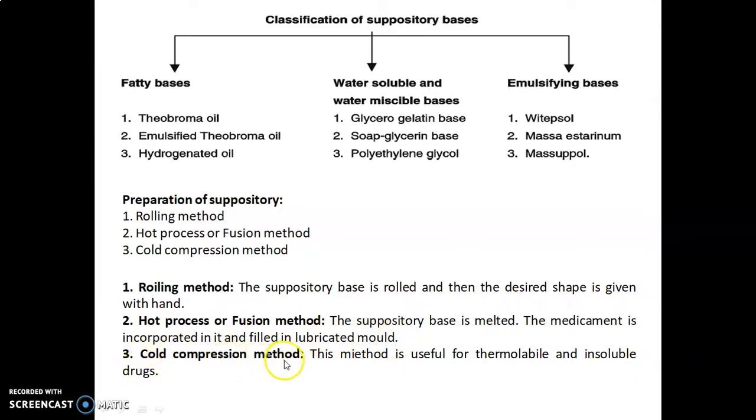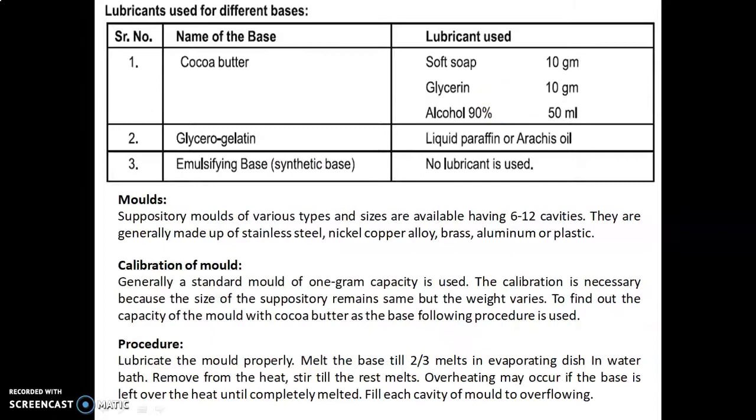Cold compression method is the third method. This method is useful for thermolabile and insoluble drugs, those which are susceptible to heat, that are called thermolabile substances. For that, this cold compression method is used.